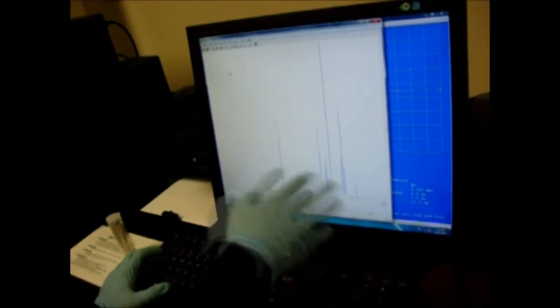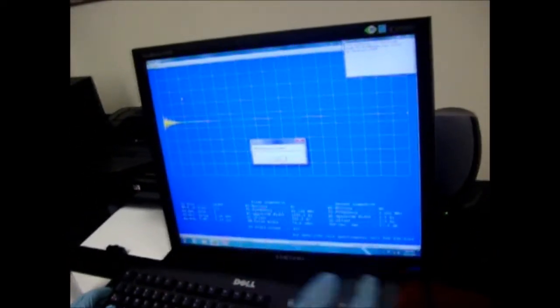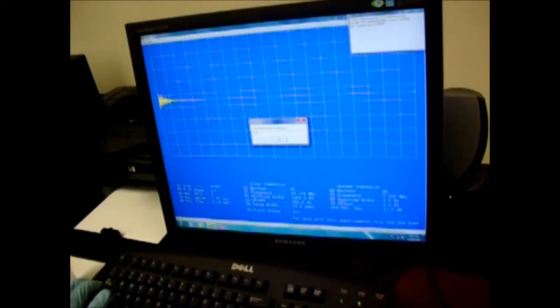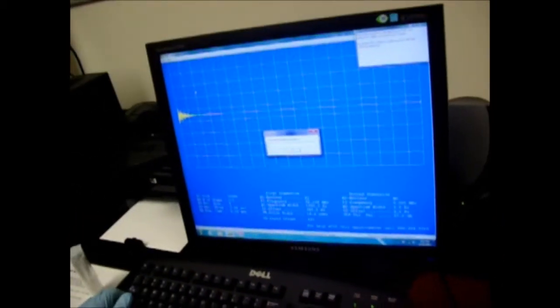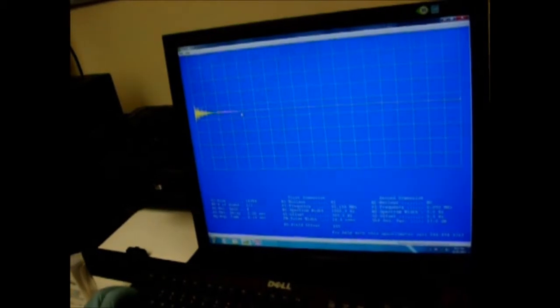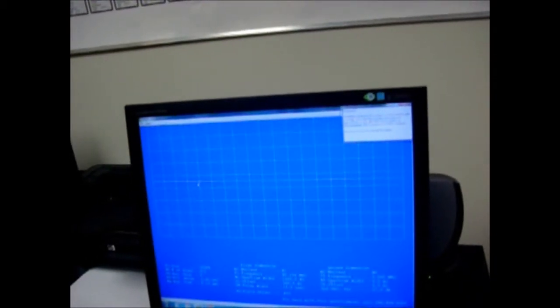So we're going to accomplish this by going back to our original spectra, then pressing Alt-Tab, then we're going to press FO, enter, and we're going to put it where the TMS was originally, which was 0.341. Enter. We want to put it at 0, so we'll put that 0. Enter. And we're going to press Alt-Tab again, and then we will press ZG on the other screen. Enter. Enter. And it's running.